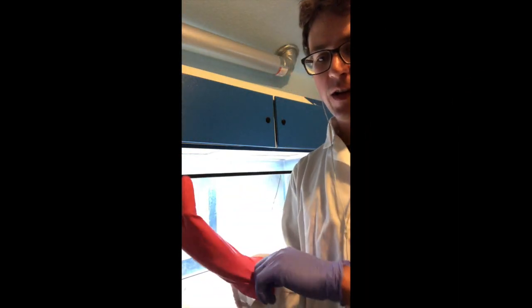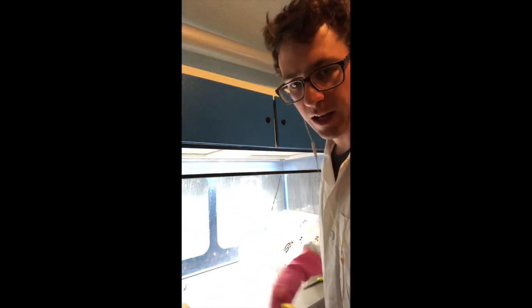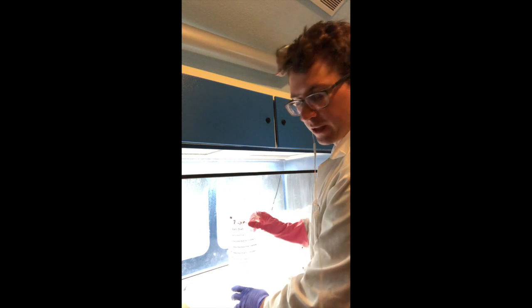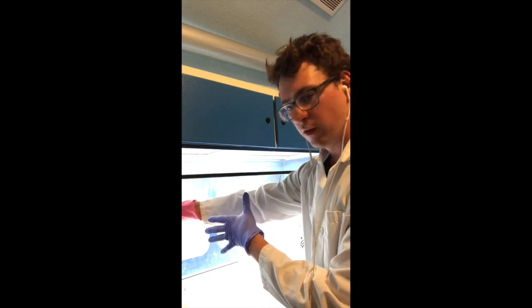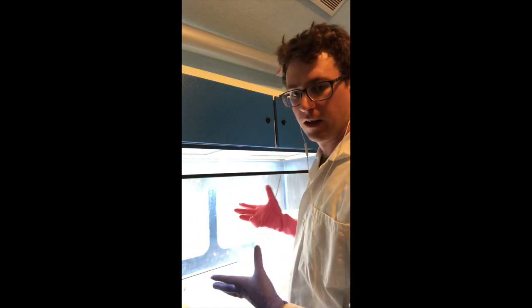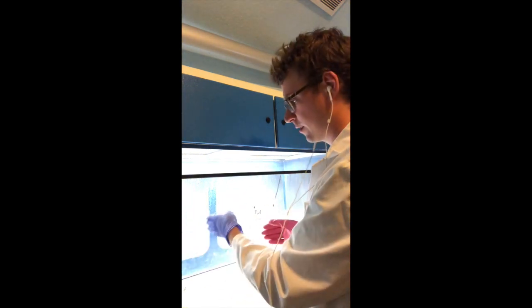So I've got that molten agar out, and I threw on this extra glove just for heat protection. But I'm just gonna start pouring out plates, and the idea for pouring stacks is to start from the back and then move from either left to right or right to left, whichever hand you prefer, but I'm right-handed, so I'm gonna go from left to right.